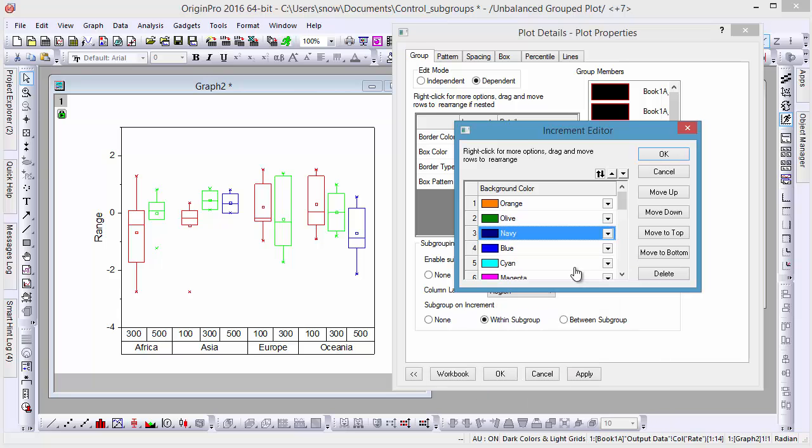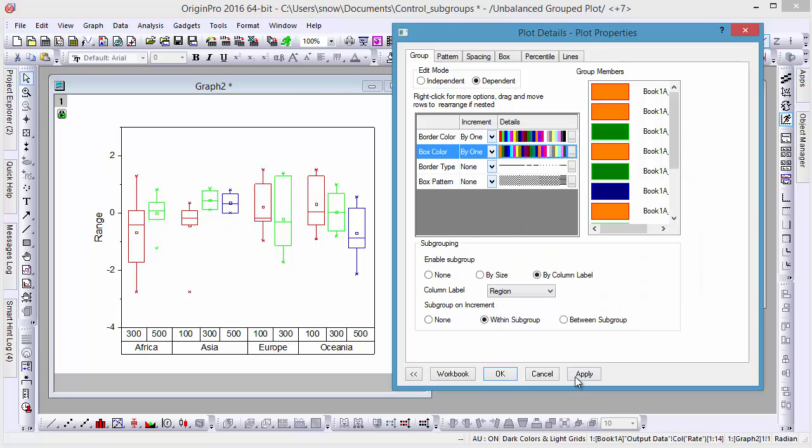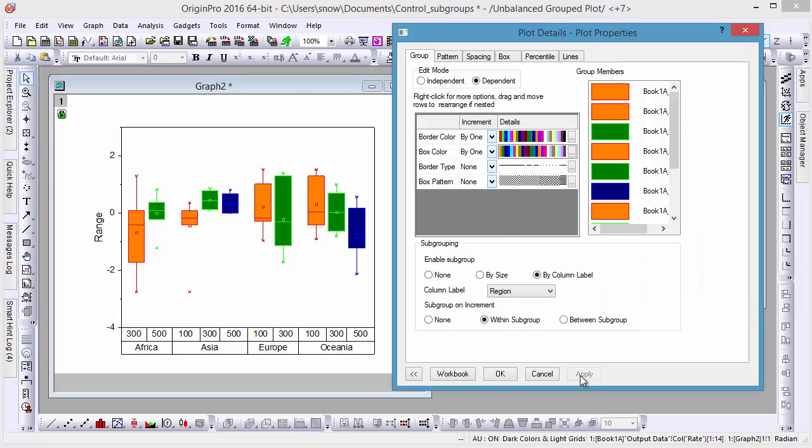To make this change, simply click Apply, and that's how you can specify subgroups of a plot by the column label rows.